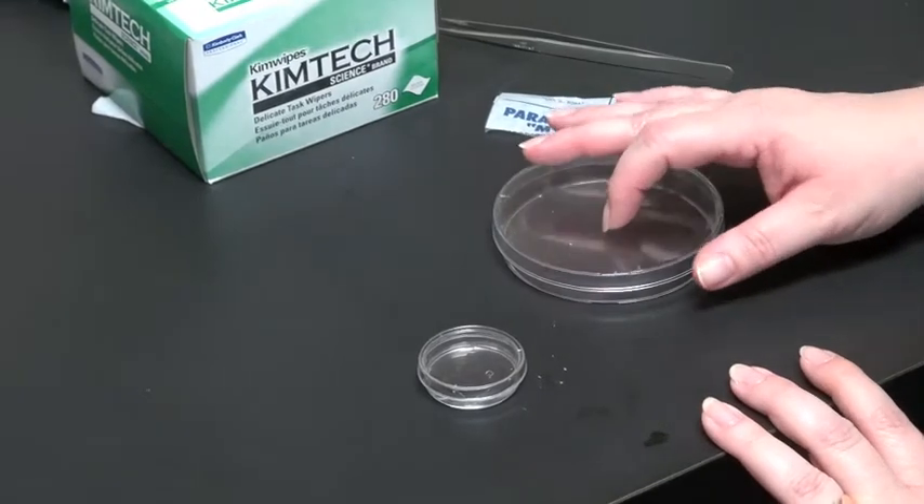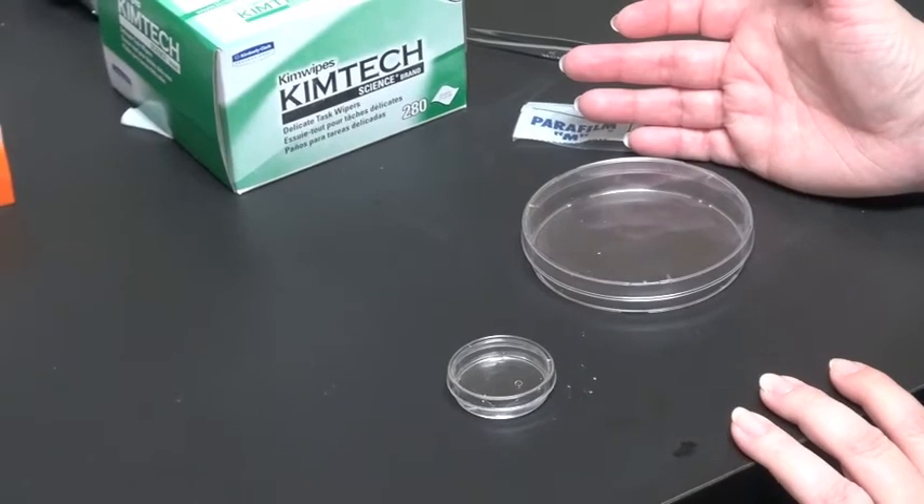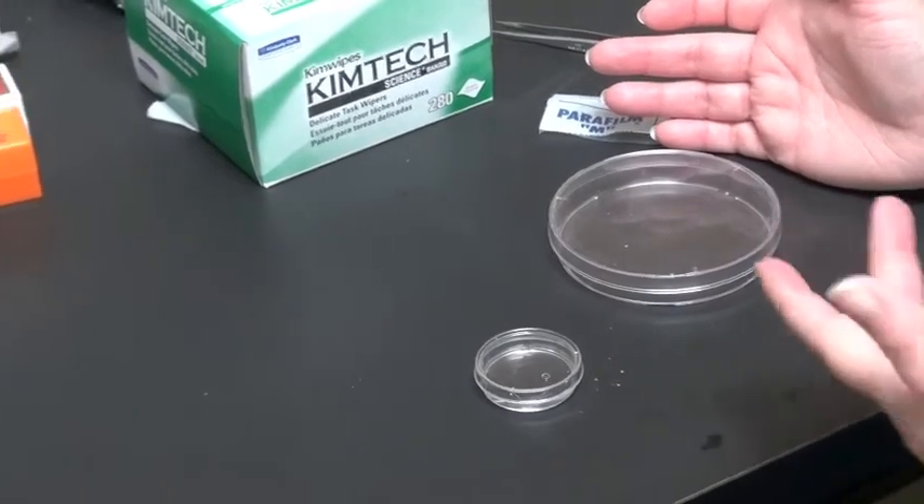You take a Petri dish — it doesn't have to be as large as this one I have — as long as the cover slip can fit comfortably in it without a lot of manipulation.